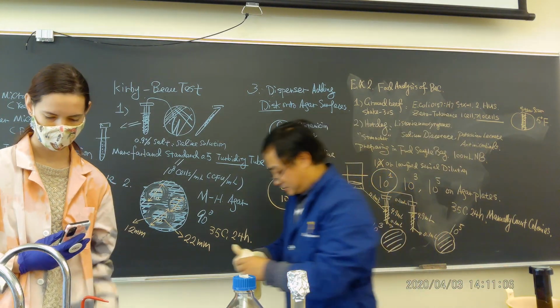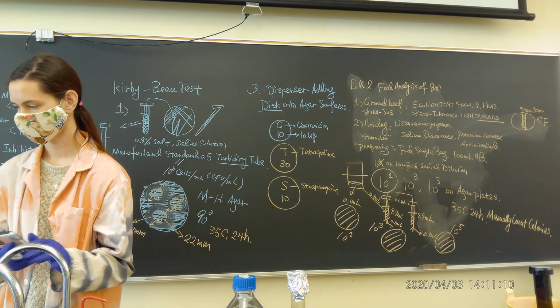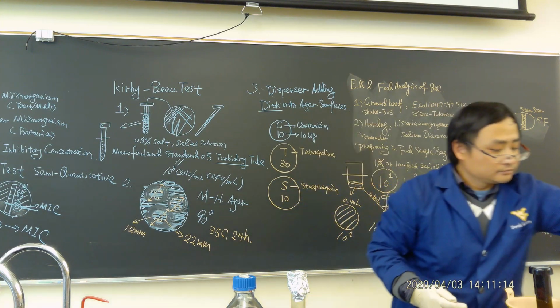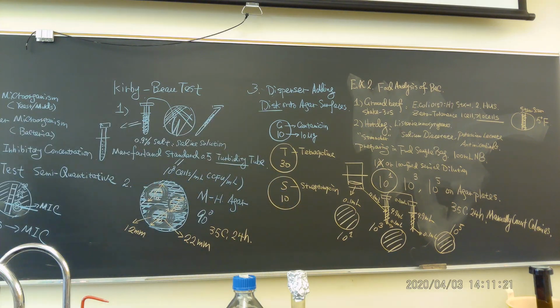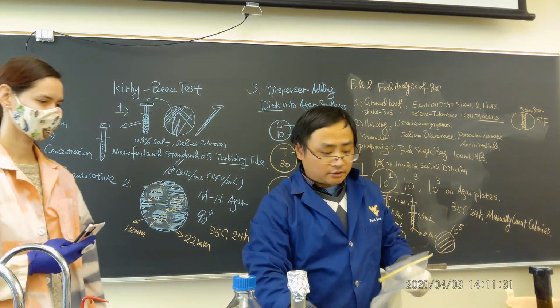Okay, that's good. This one is not good, it has not been used for a long time, maybe 5 years. That's why these gloves look like this. So we have 2 different sample bags we'll be using. You maybe stick with only one, I don't have that many bags. So this is how we're going to do the sampling.